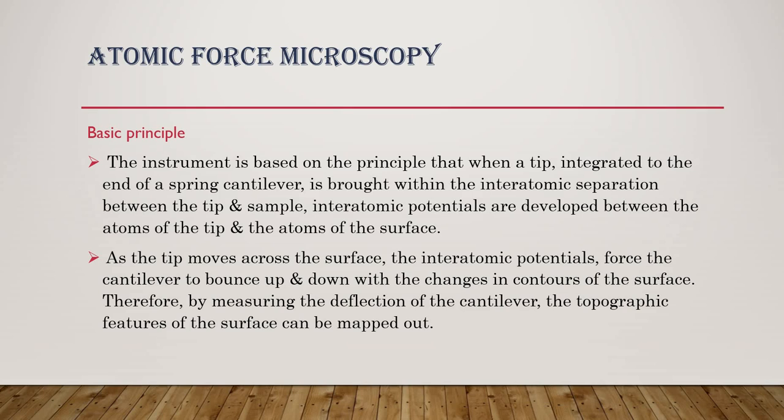The instrument is based on the principle that when a tip integrated to the end of the spring cantilever is brought within interatomic separation between the tip and sample, interatomic potentials are developed between the atoms of the tip and the atoms of the surface.